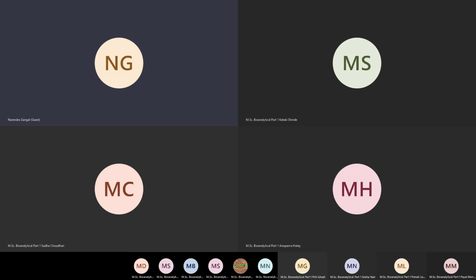For interpretation of chemical ionization spectra, you will always need electron ionization spectra, plus the chemical ionization spectra. Chemical ionization spectra will give me M plus 1, that is, an indication about the molecular ion or possible molecular weight, and EI, electron ionization, will give me an indication of what kind of fragments are there. So when I combine the information of the molecular ion, or the possible molecular weight of the molecule, and the fragments, then I will be able to interpret the structure of that particular molecule.